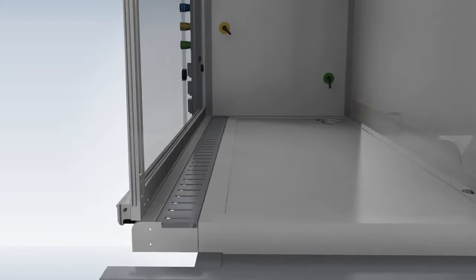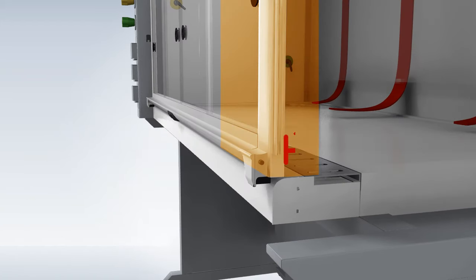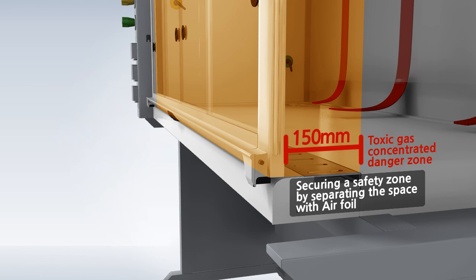The space in between a front door to the 150 millimeters from the door is considered to be a toxic gas-concentrated danger zone. But, the CHC Lab fume hood secures a safety zone by separating the danger zone with its airfoil.